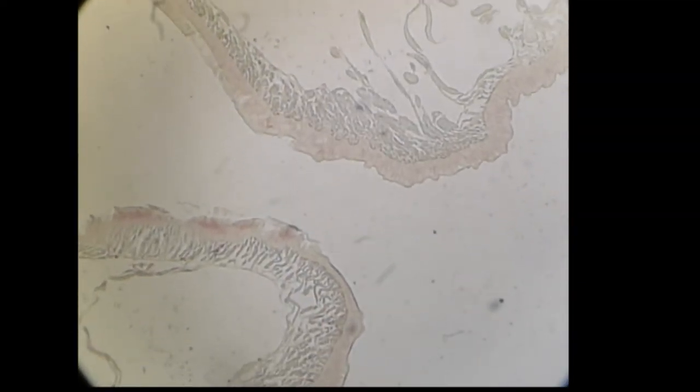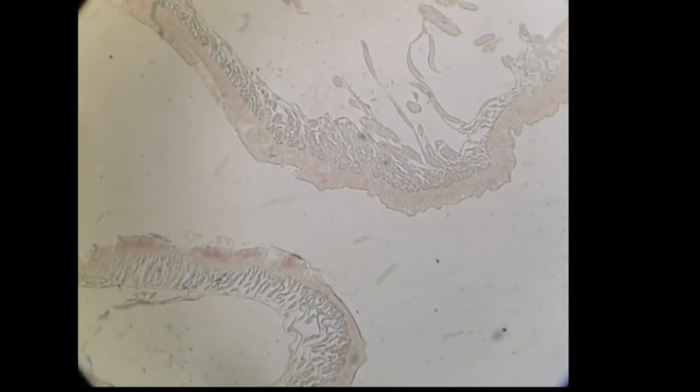The peristomium has a high concentration of sensory organs including chemoreceptors that sense different chemical signals, mechanoreceptors that sense touch, and light receptors, which is about as far as earthworms have got in terms of developing eyes. It's very hard to spot these sensory organs within a section, but we can have a little go now.